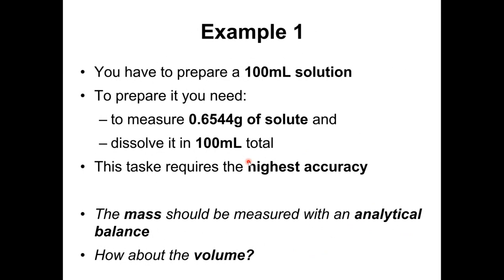Now, let's go, for example, to practice what we just discussed. So when it comes to measuring volume, the three main criteria you use are the task. What does the task imply? Accuracy or speed, the availability, and the total volume. So let's go through the first example.